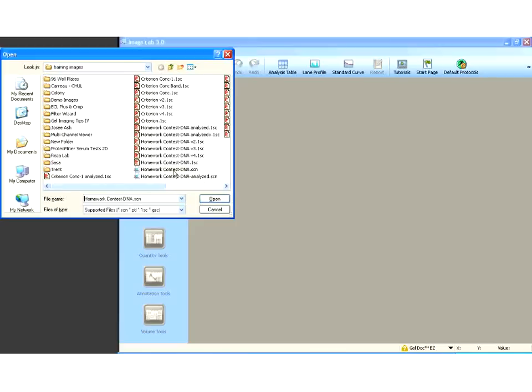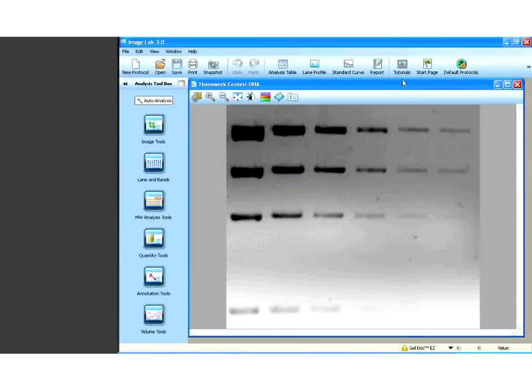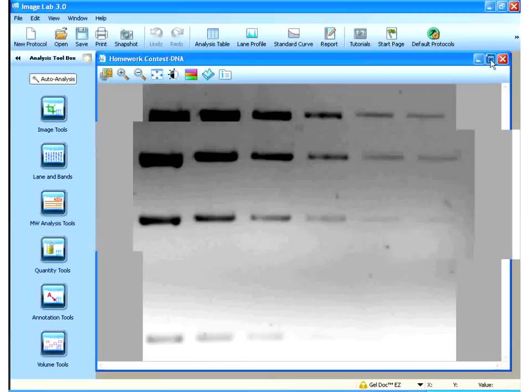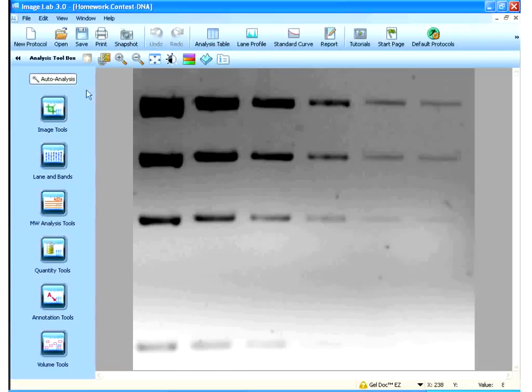We'll open this one, homocontest DNA. So here's a file that was taken, it was just a dilution series of DNA. And I've done this before in a previous video, but I wanted to show you the new features in the software between version 2 and version 3, which is the newest version of the software. So, we have a file that's open. As we can see, it's a dilution series of DNA.